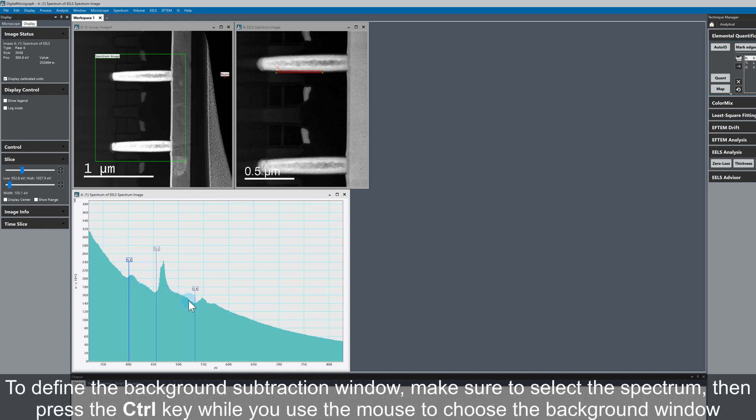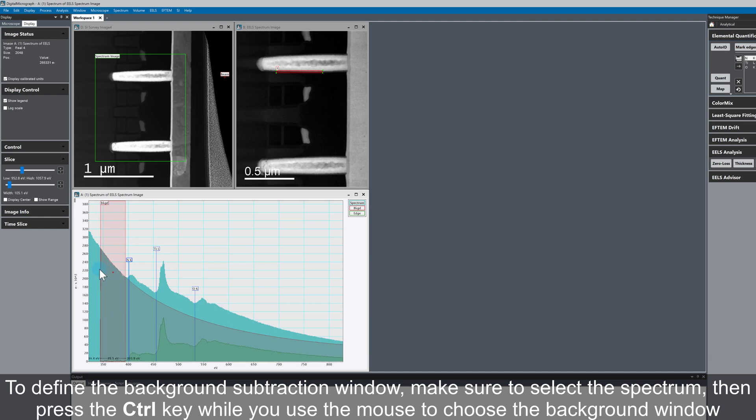The first thing we need to do is define a background subtraction window. Make sure your spectrum is selected, hold down the control key on the keyboard, left click and drag, and then draw a background window.